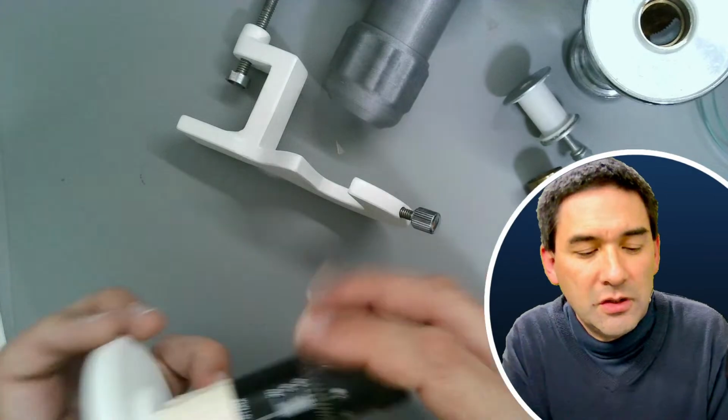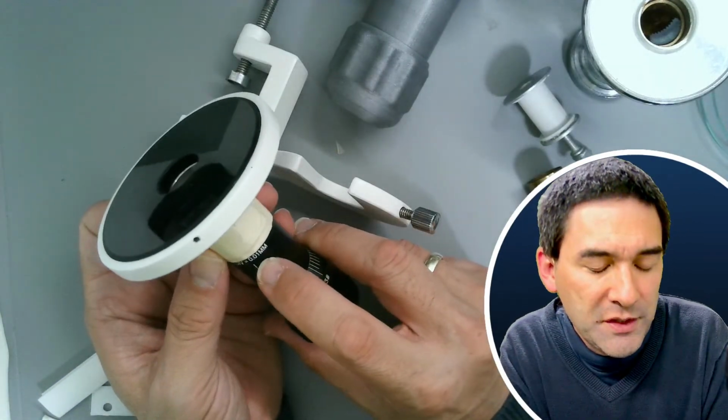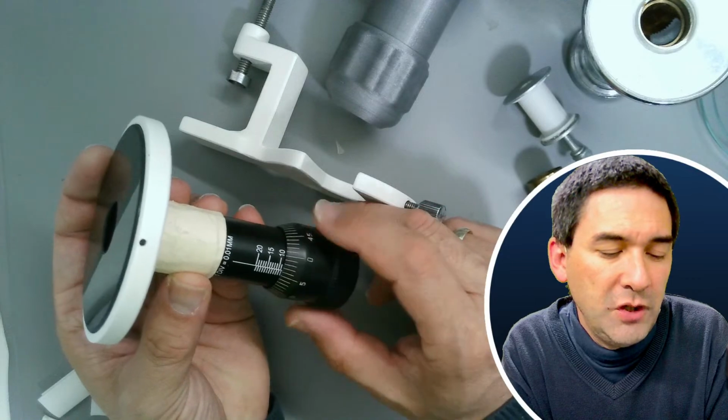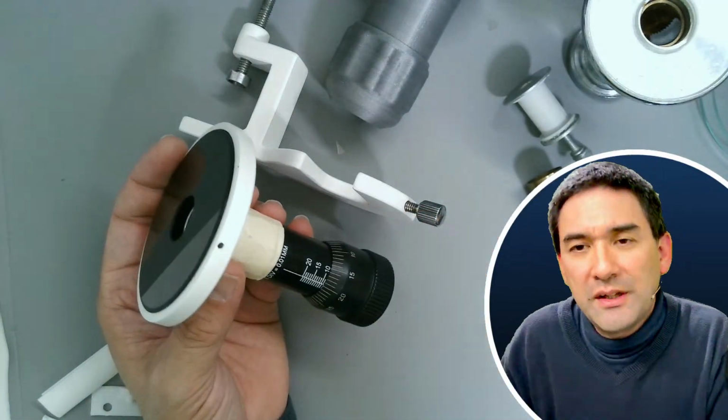But you can also see quite nicely that one division is 0.01 millimeter, so that's essentially 10 micrometers. So if you're moving up one division, then essentially it's 10 micrometers, which is approximately the thickness of a eukaryotic cell.